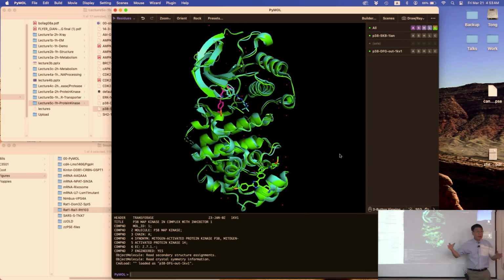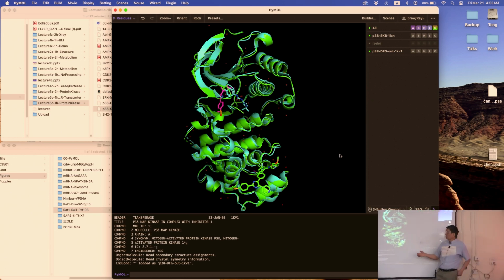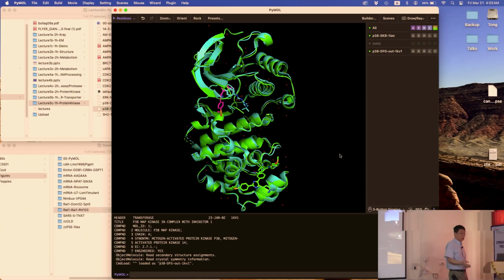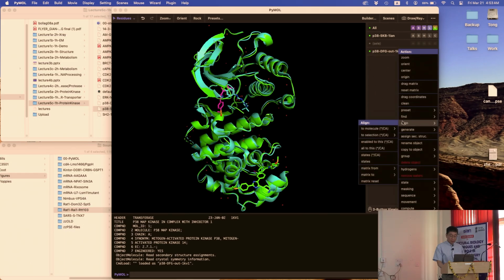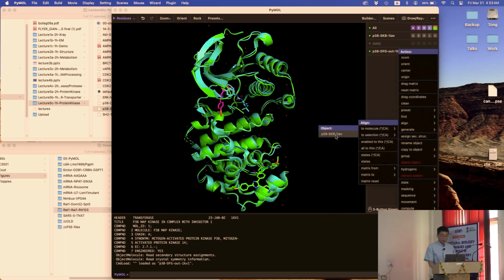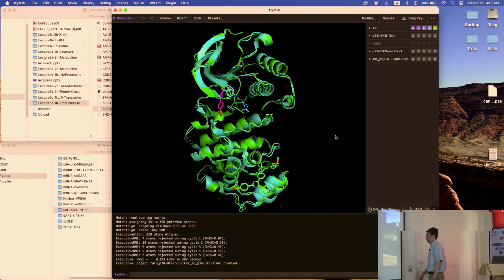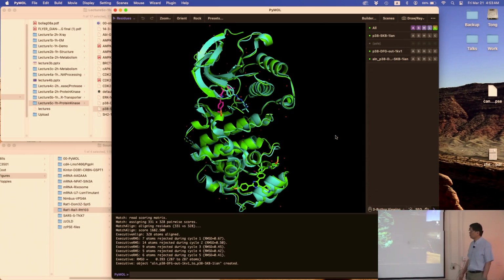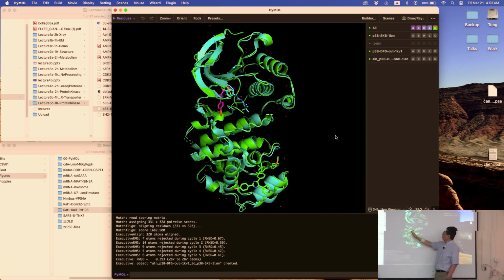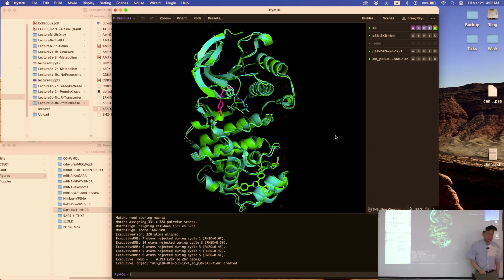So first we do align the 2 structures so that we make sure that there is no systematic difference between them. So to align the 2 structure, just go to A. For the DFG out structure, they say align, and then align to SKB. So you can see a small little change. And oh, by the way, you can also see the RMSD from the text window as well, if you're interested in looking at that. So now we have the 2 structures. The SKB structure green and the purple, and then this is the compound for the DFG out, so we'll give a different color as well.